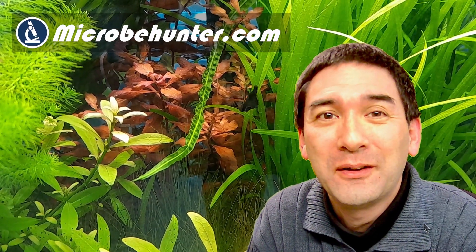Behind me, a beautiful aquarium with many plants and many fish, and actually also many water microorganisms that could be observed under the microscope.